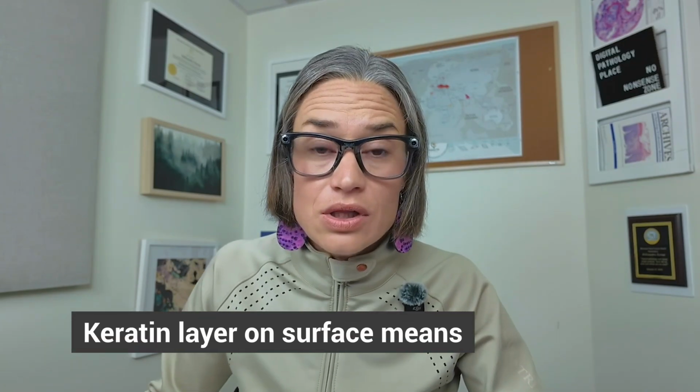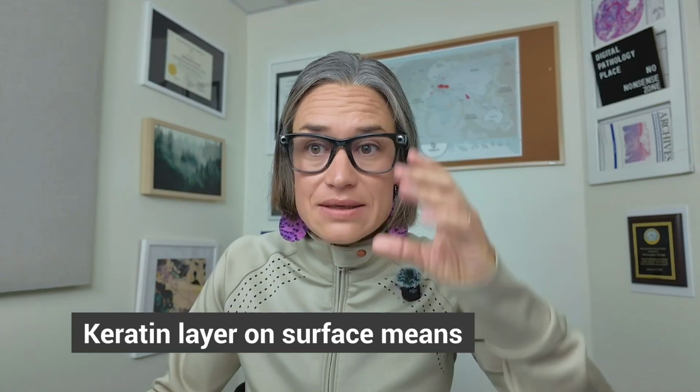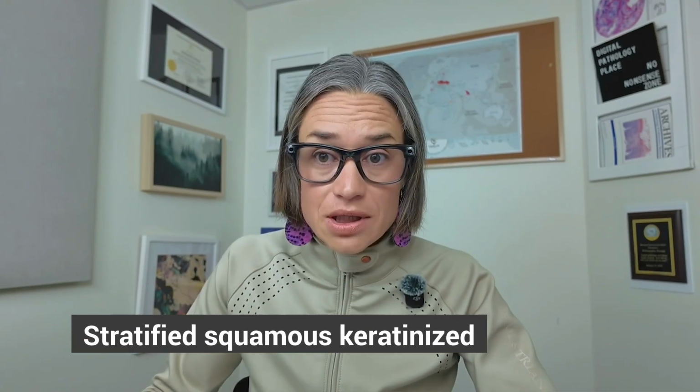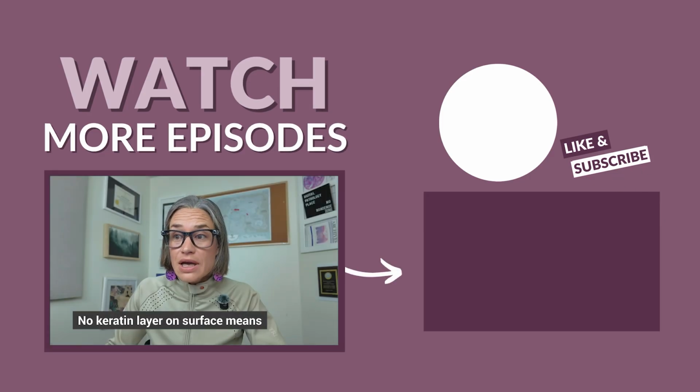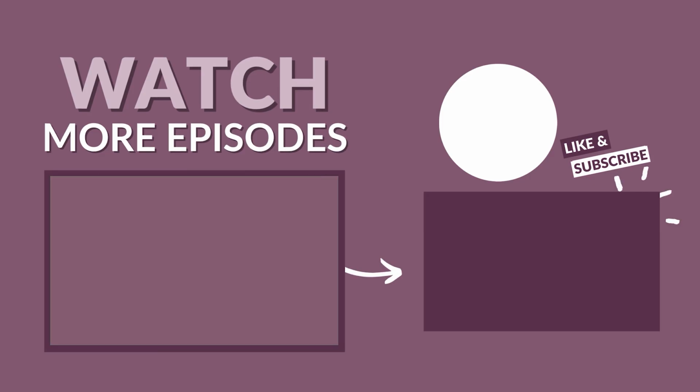So the question is, is there a keratin layer on the surface? If yes, think stratified squamous keratinized. If no, and the surface is still flattened with nuclei, think stratified squamous non-keratinized.